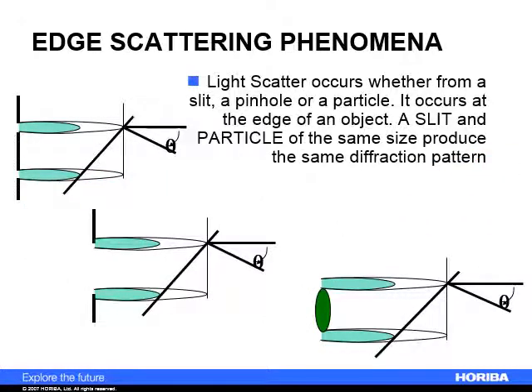So this slide right here is the summary of that. No matter how you set up the experiment, if you consider it a slit, if you consider it just a pinhole, if you consider it a particle, all of that math related to scattering is the same. Your diffraction pattern is the same from the edges of an object.